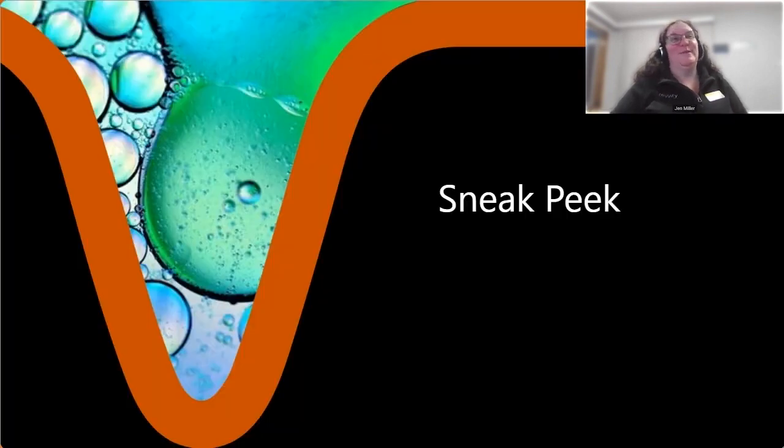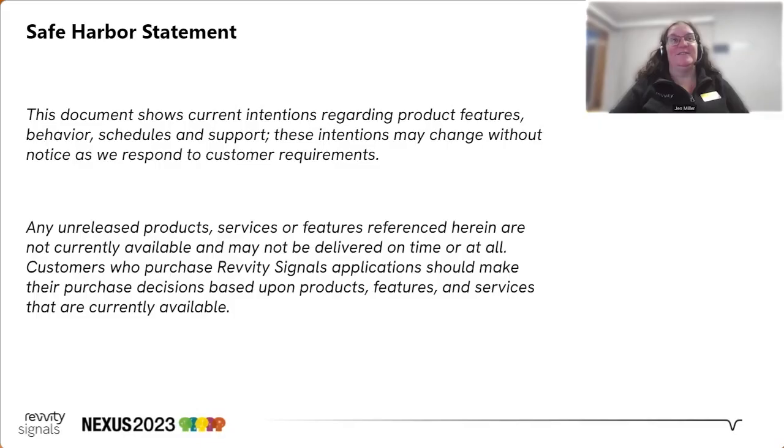One of the best parts about being a product manager is being able to interact with customers and hear feedback and desires. It all comes full circle when we're able to take that feedback and develop a new feature or functionality that delights our users. I hope you'll enjoy the next few slides as we take a look forward, as this is currently in the minds and even being developed by our amazing and talented teams. As always, I have to show you the safe harbor statement because these are not done, but we're working on them.